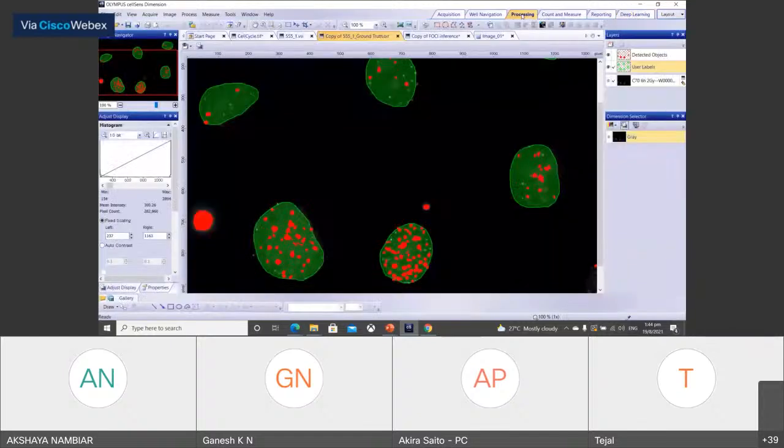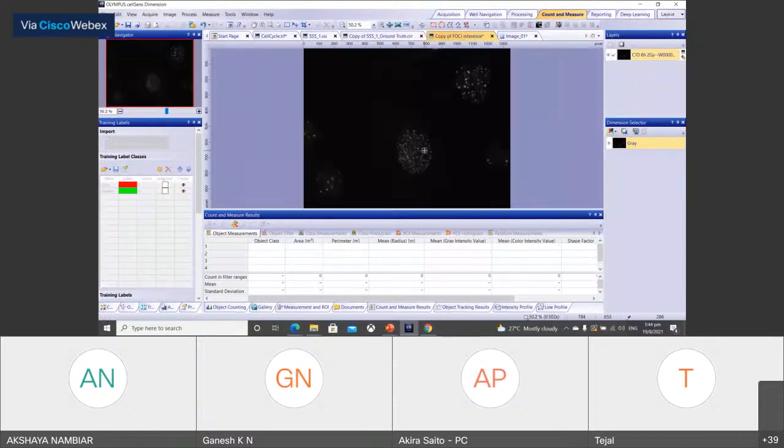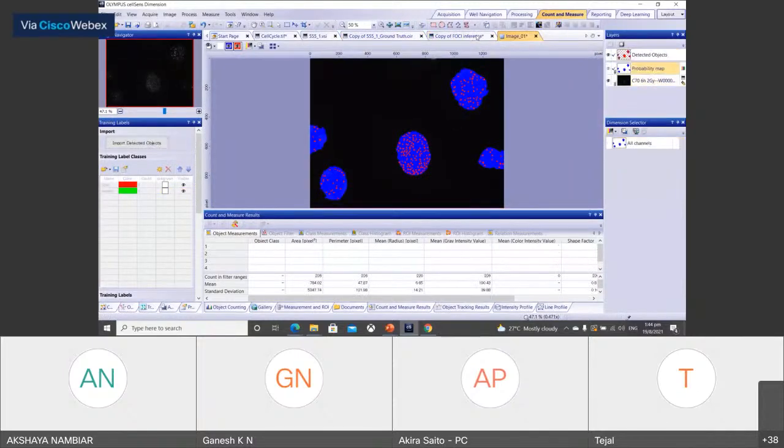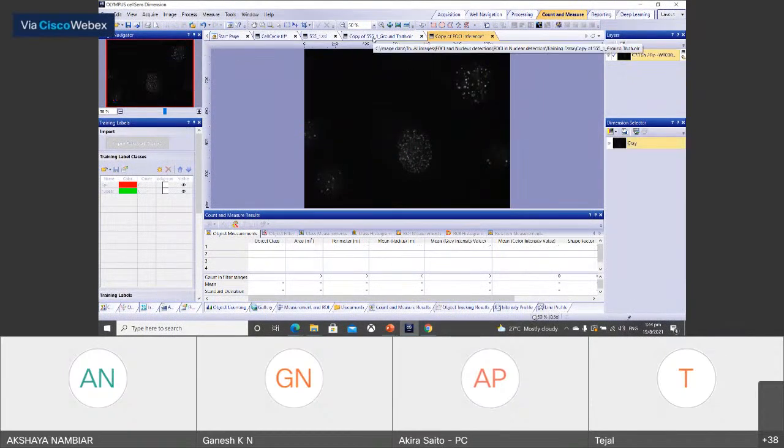Okay, so once it is created, then in our software there will be the neural network file, the NN file, which is dedicated to the neural network file format. Then, for example, this is another similar image, sorry, the same sample with a different position.